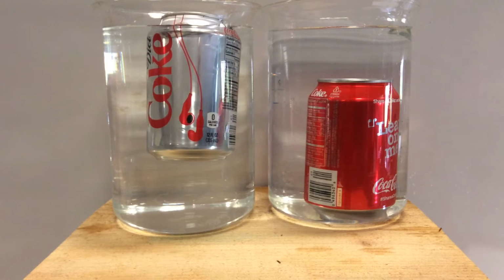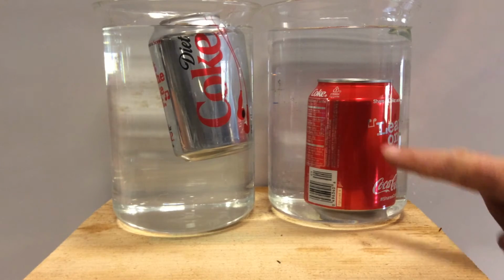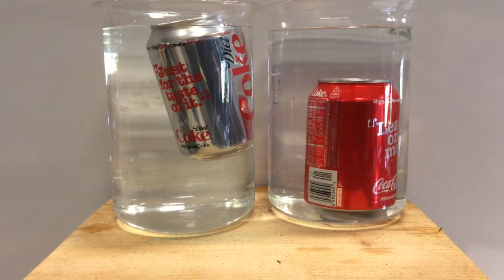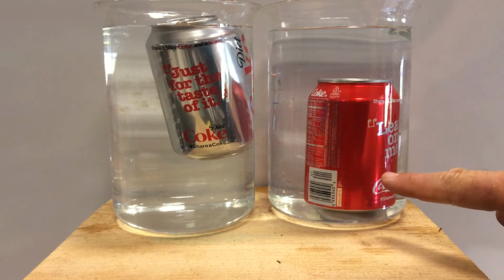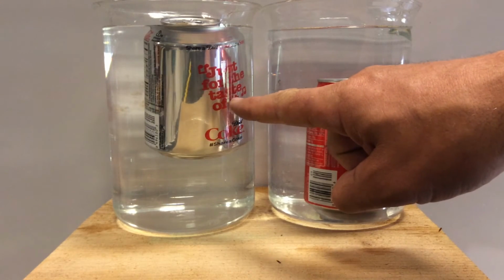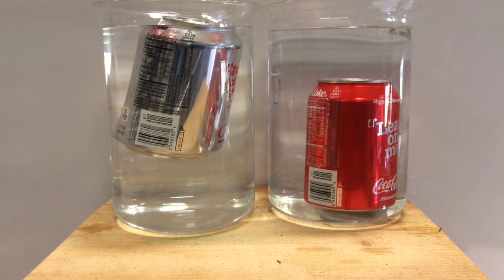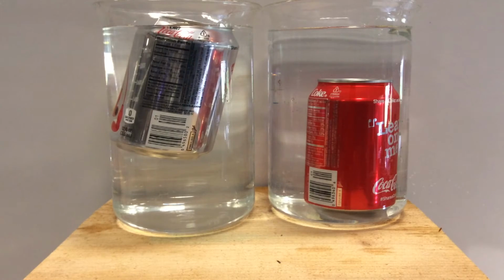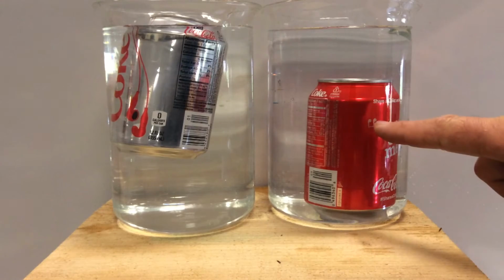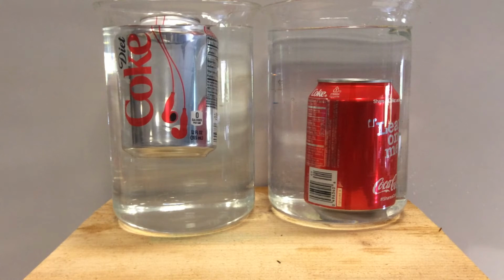So in this lab, we're going to use the premise, because the point of the lab, yes, is to calculate the density of both the Coke, the Diet Coke, and the water. From our past observations, we should know that the Coke should be heavier, at least a higher density than the water, and the Diet Coke at some point seems to be less dense than water, and that's also very troubling to some students. Do not forget that there is CO2 gas trapped inside here that's messing with this density as well. So don't forget about the carbonation.